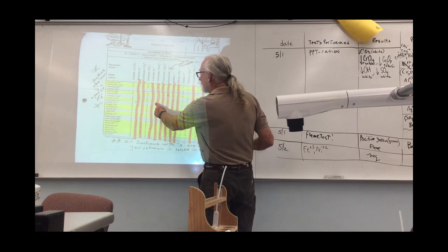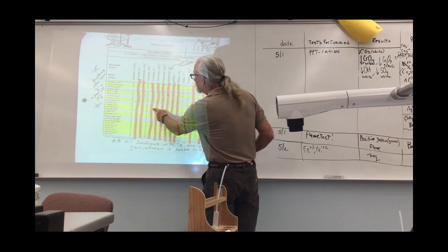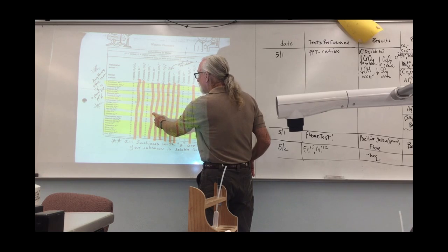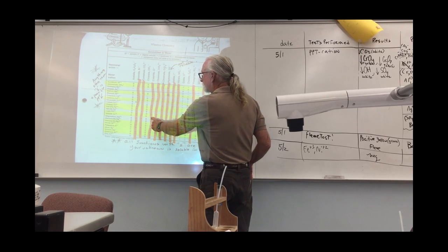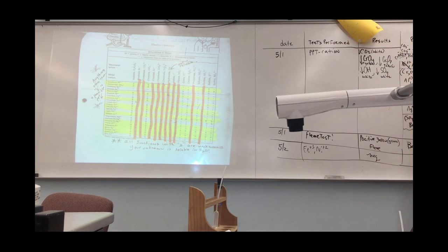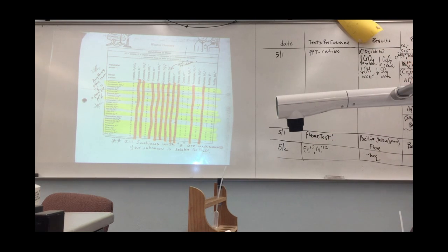I keep going down the list. These are D's, aren't they? Or P, D's or P. They react anyway. Copper and iron do. Lead, yeah. Oh, look at lithium. Lithium does not react with my unknown. So I eliminate lithium. Okay? When I'm finished, I now have this list, which is shorter than this list.